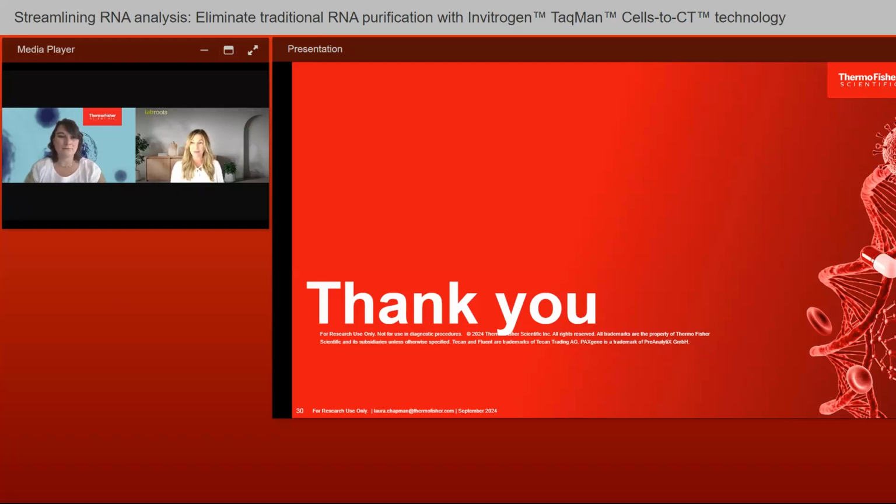Are these kits compatible with RNA stabilizers like RNAlater, RNA Shield? We have some preliminary data looking at RNAlater, where you would still need to wash, and you would need to pellet the cells, wash and remove that stabilization reagent, and then also do the PBS wash. And we showed that that works pretty well. I've never tested with the RNA Shield, so I'm not sure about that one. But for RNAlater, we have some preliminary data that it would work.